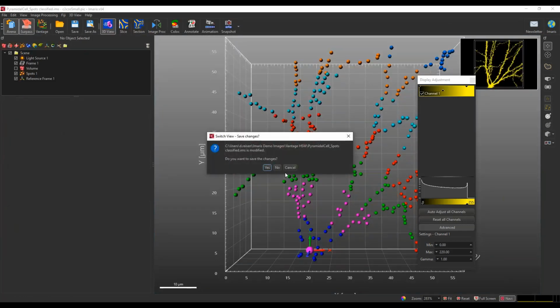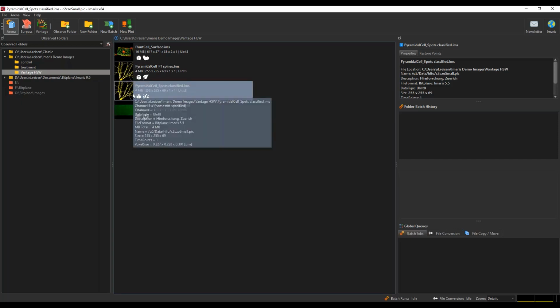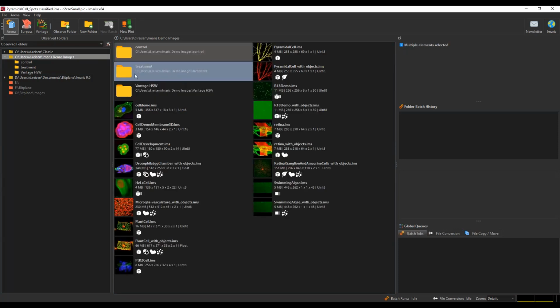And then we are still getting questions coming in about being able to pool, P-O-O-L, sorry, my Southern accent is coming out, to pool data sets to then be able to have groups that you can compare. So Daniel, can you go back? I'm going to say it this time to see if that helps, because sometimes it helps just hearing it from two different people. Yep, click on that folder, please. Yes, so in this one.